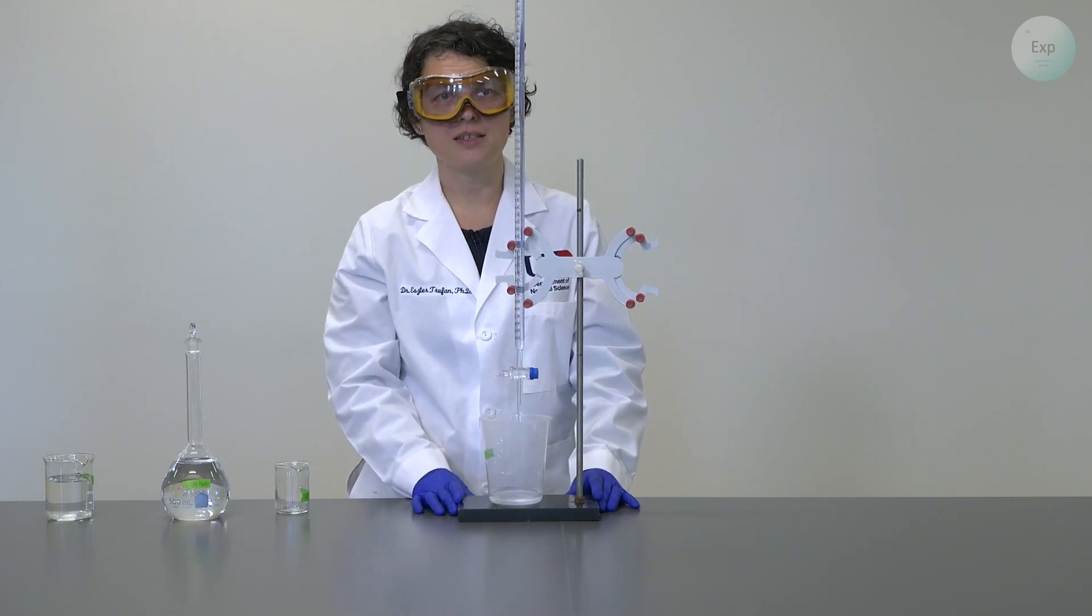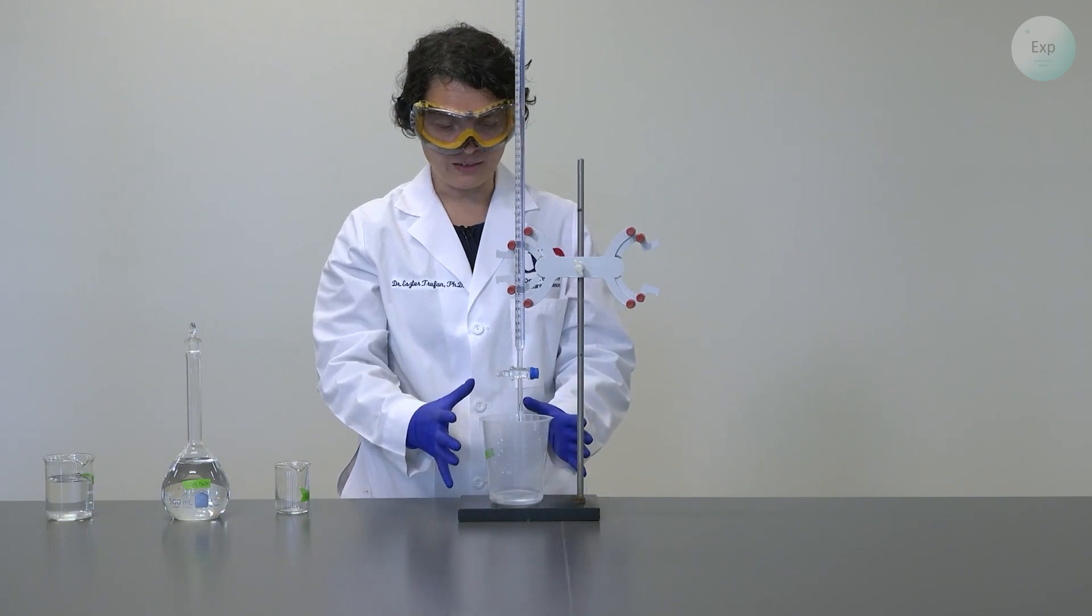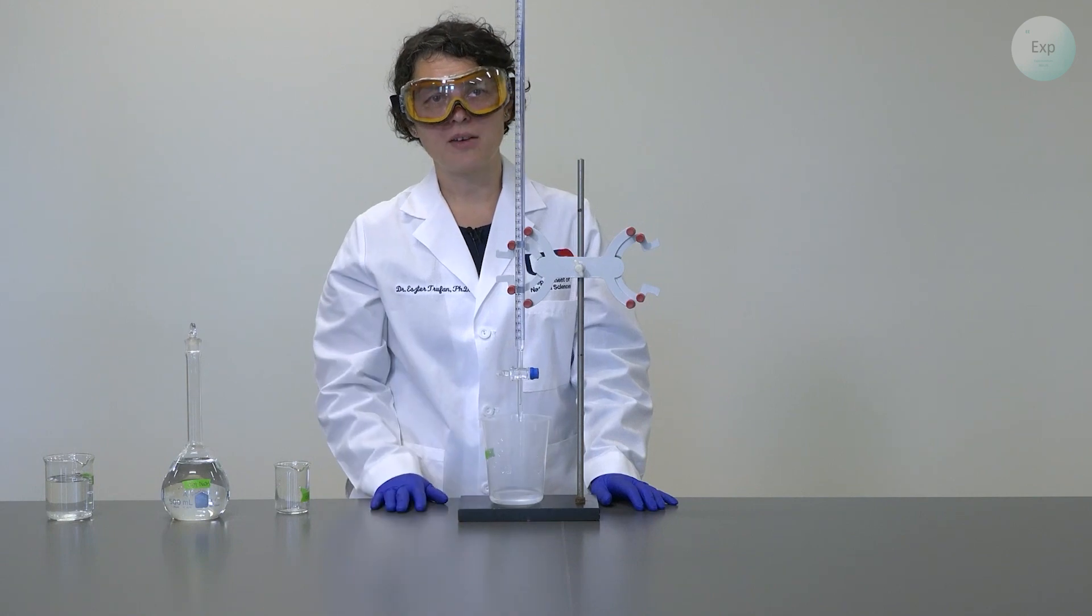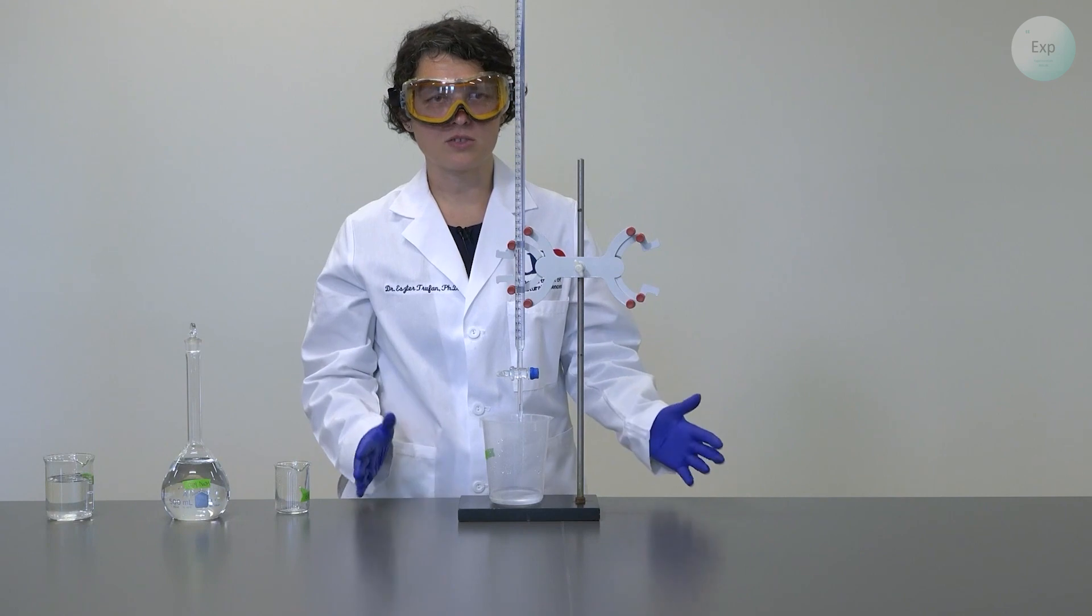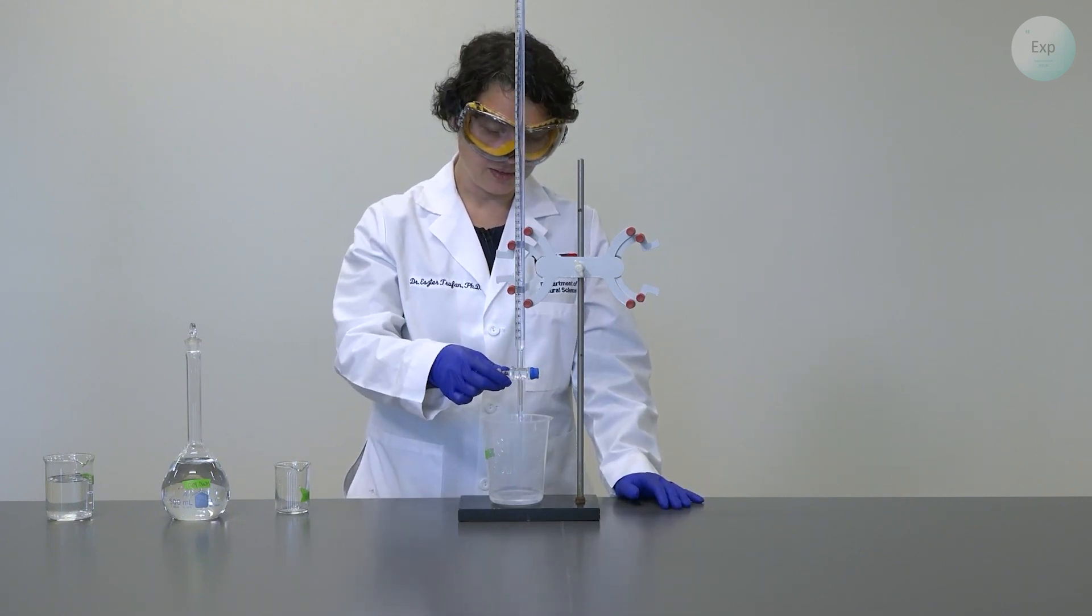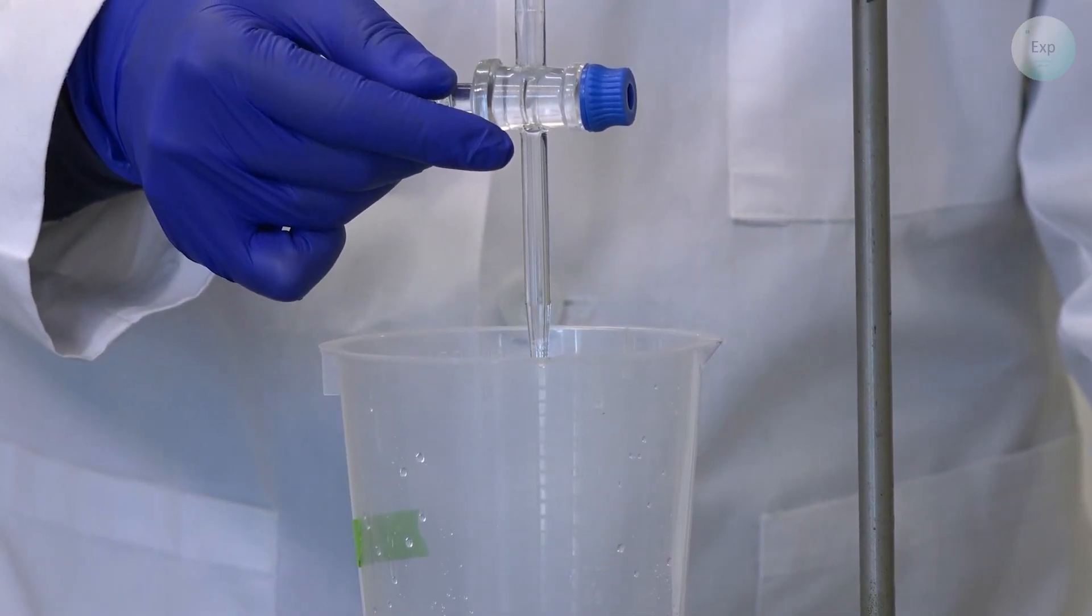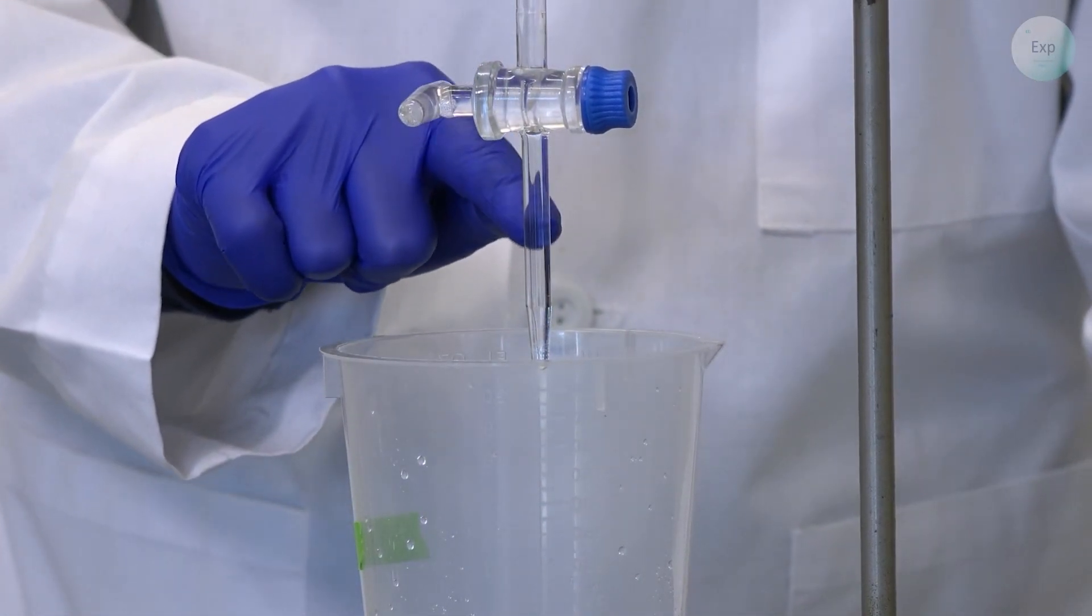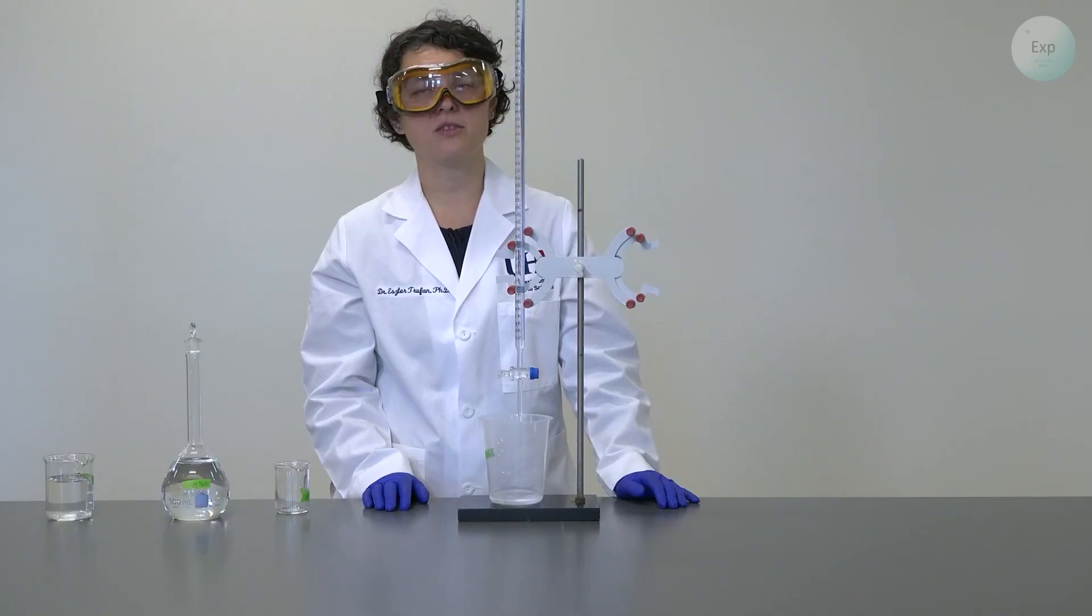because every time we add a known volume of solution into our analyte container, whatever it is in the burette tip will be counted as added volume. And so if there is air, then we count extra volume of titrant that wasn't really there. So to remove that, we simply need to open our stopcock in the open position and release some of our sodium hydroxide solution. And when this tip is completely filled with the sodium hydroxide solution, we close the stopcock and we consider our burette charged.